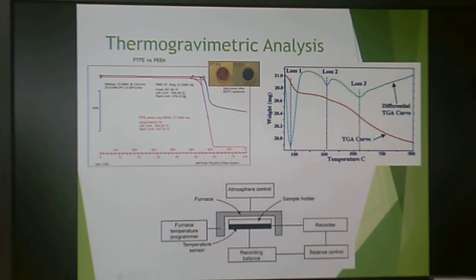These are very high temperature polymers, both of them. Now remember, this is Celsius. This is not Fahrenheit. This is not where you're broiling meat. This is much, much higher than that. Your oven does not reach this temperature. So these both went up to what appears to be about 800 Celsius in terms of the analysis temperature in order to see degradation of both samples.